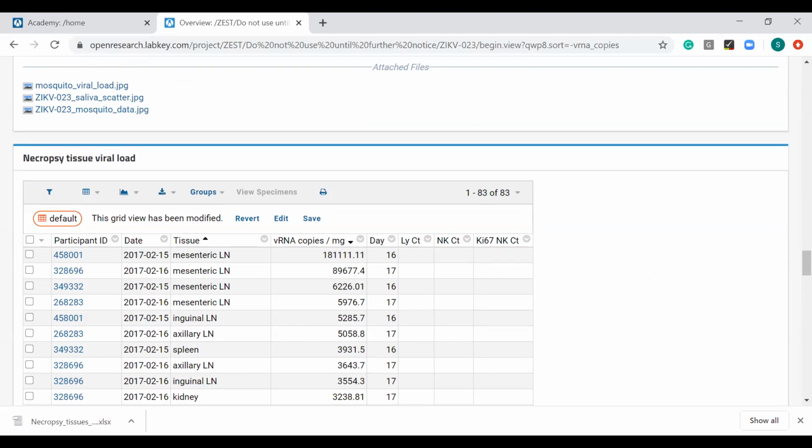I did see there's some questions in the chat here. Anything, Jason, I should address before I keep going? There's a couple I've answered directly, but there is one. Yeah. We understand that to join data, LabKey requires a participant ID and some concept of time or a scheduled event, as you mentioned at the beginning.